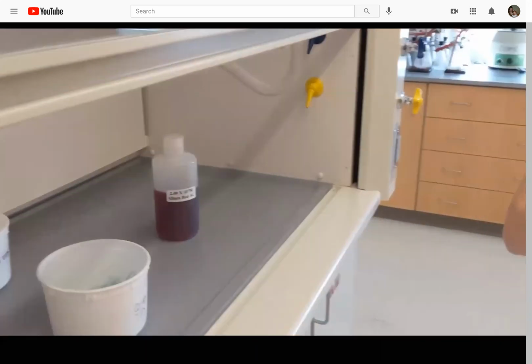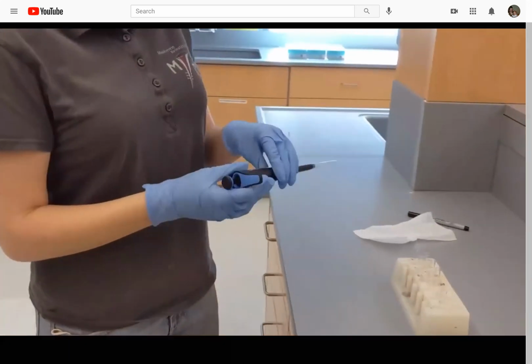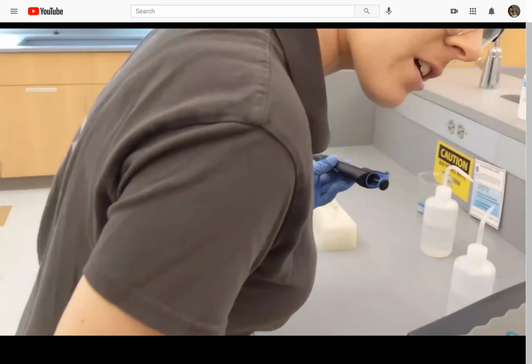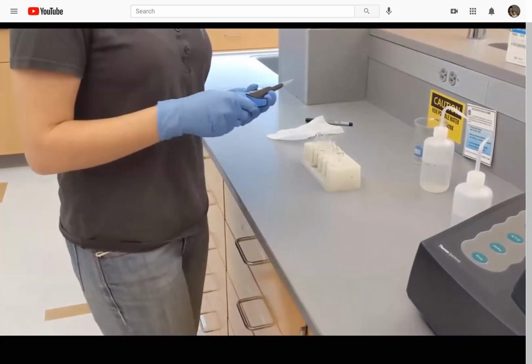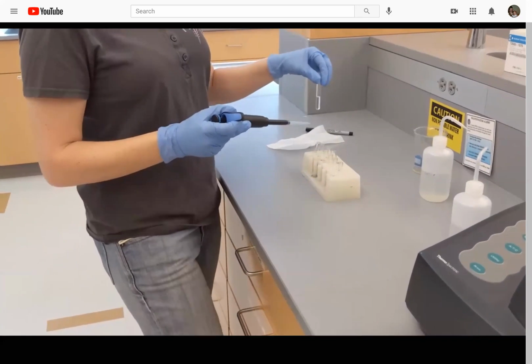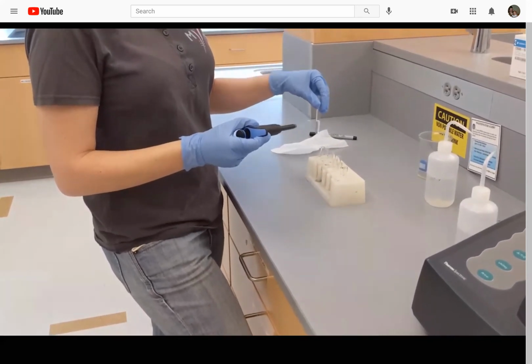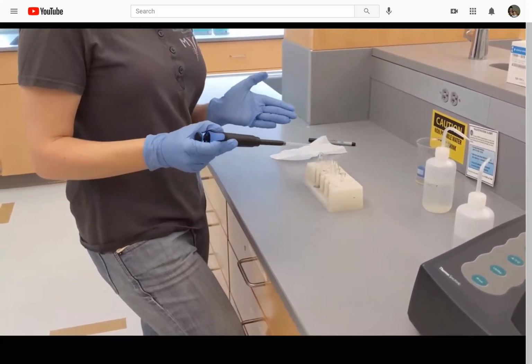I'm now going to go back to my workstation and add 0.5 milliliters of my standard solution to the first test tube. I will then add 0.5 milliliters of this solution that I'm going to create into my next test tube, and this is known as a serial dilution.